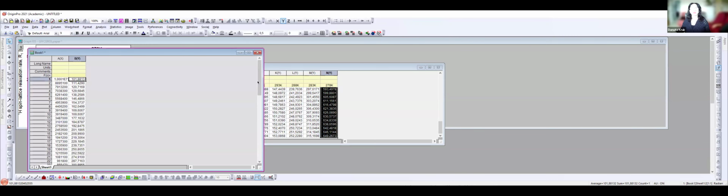Look, it started from 10 megahertz. And please be careful. You see that my frequency is in hertz. This is also a quite common mistake that people, for instance, plot relaxation rate versus frequency in megahertz or kilohertz, and then they have the frequency not in hertz, but kilo or megahertz, and they do not realize that, and anyway try to find diffusion coefficients from that, and then they get nonsense values.